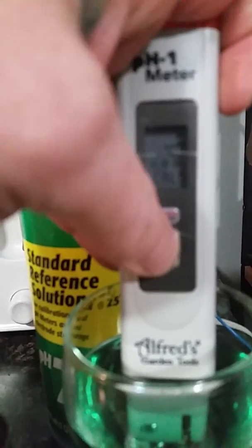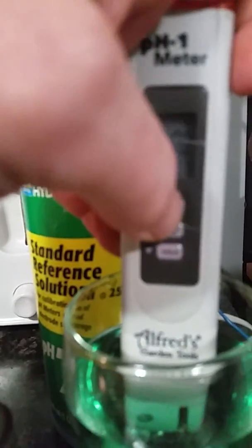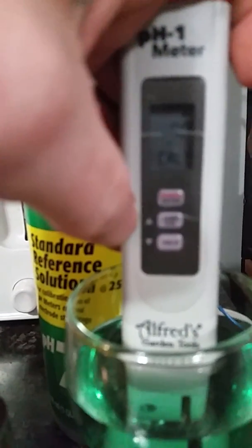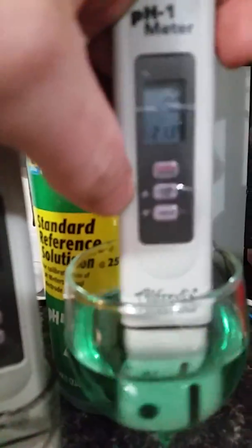As you can see, there's a four, there's a seven, and there's a ten. So we want to run seven and we're going to hit enter — it's going to calibrate. Now we know she's set up for seven.